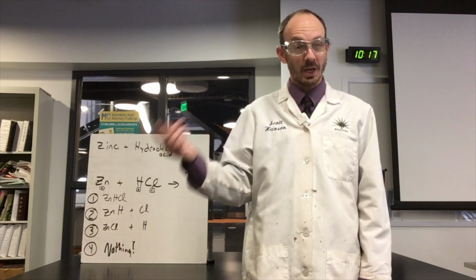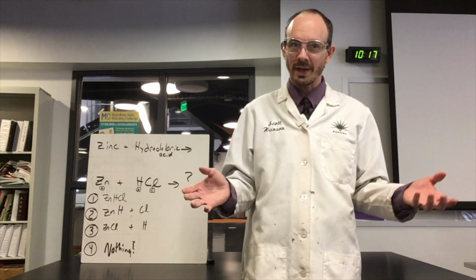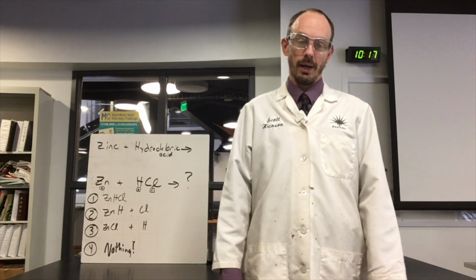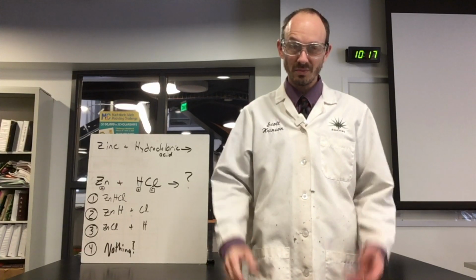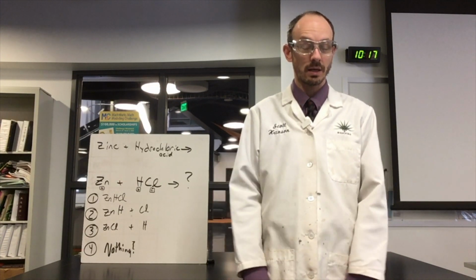However, when I bring the sample over to here, you're going to see that it has started to turn a little bit red, but that will not affect your final data. A little bit red is better than the deep red. Plus, those impurities in there are making it turn that yellow and red color. It should be a nice white color, but impurities in the HCl that we use make it that color.